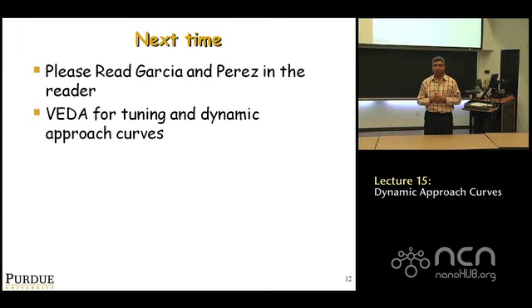Can you guys tell me, what did we call attractive? When is the cantilever in the attractive regime when we did static force distance curves? Well, whenever the forces were negative. When there was a negative force, it's an attractive force. That's the definition for static AFM, when you're in the attractive and repulsive range, okay?